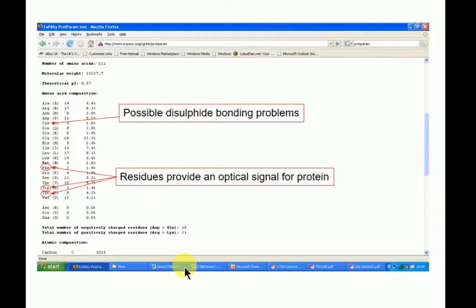So you should always, first thing you do when you see the sequence, count the number of cysteines. If it's an odd number, then you can pretty much guarantee that one of your cysteines is free, and you should add a reducing agent to stop your cysteines meeting each other in solution and just making chains of your protein. So the cheapest reducing agent is something like beta-mercaptoethanol, but it's volatile. More expensive ones like TCEP are better at reducing and staying in solution and keeping your protein happy.